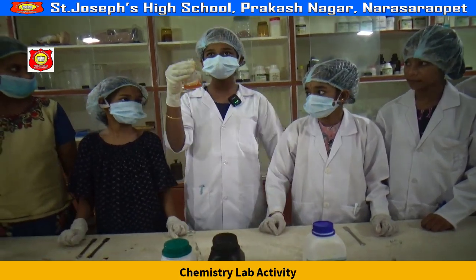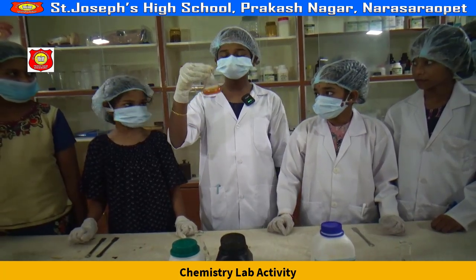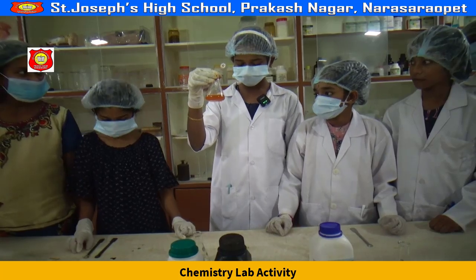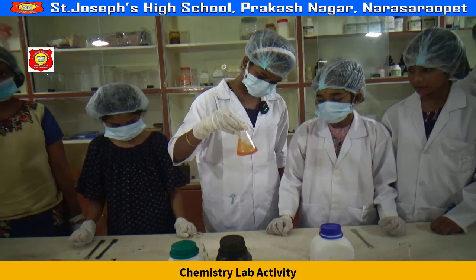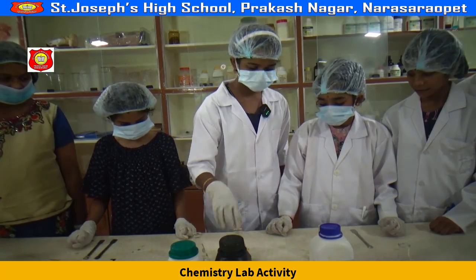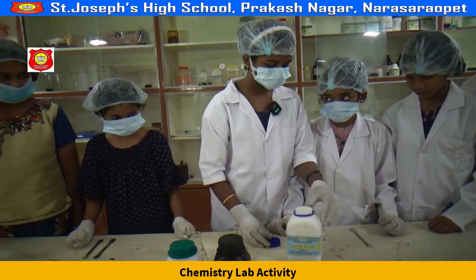Now, the formula of ferric chloride is FeCl3 and the molecular weight of it is 162.21. Now I am going to add sodium fluoride.